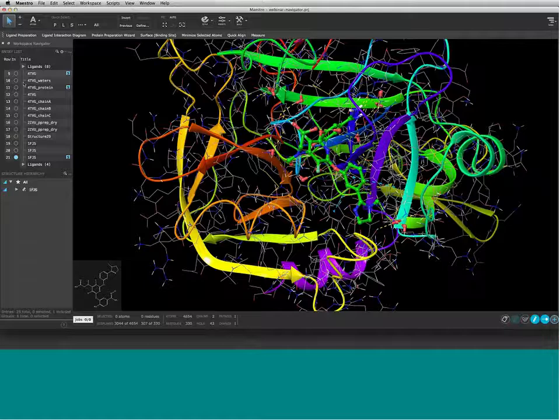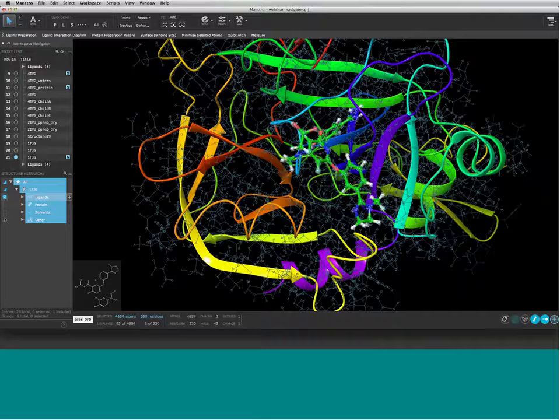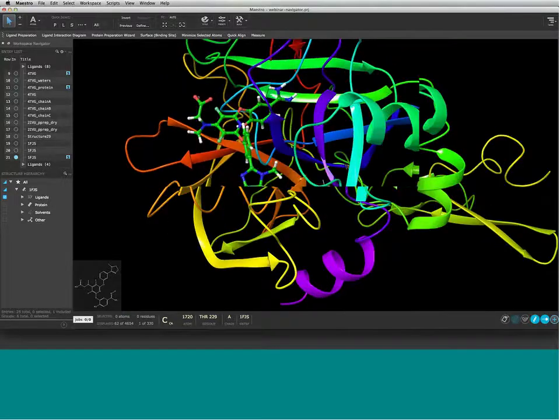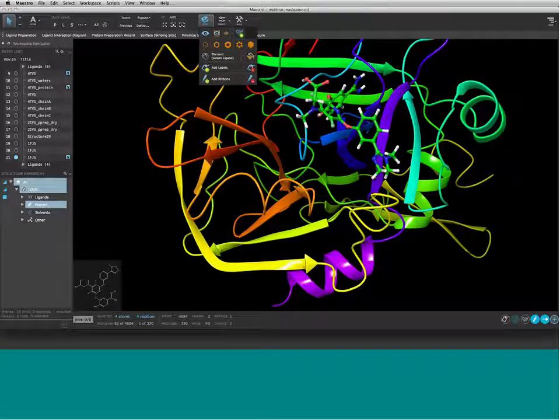Some people like to work with no atoms visible in the workspace, or maybe just the ligand and none of the protein atoms. Occasionally, though, they might want to see something or do something with one of the residues. Right now, if you have the ribbon here, you can click on the ribbon and select the alpha carbon for that residue. You can build up a selection with shift click and so forth, and use the additive and subtractive picking. Once you do that, you see it says I have 4 atoms, 4 residues selected. And I can use this to, for instance, delete the ribbon.